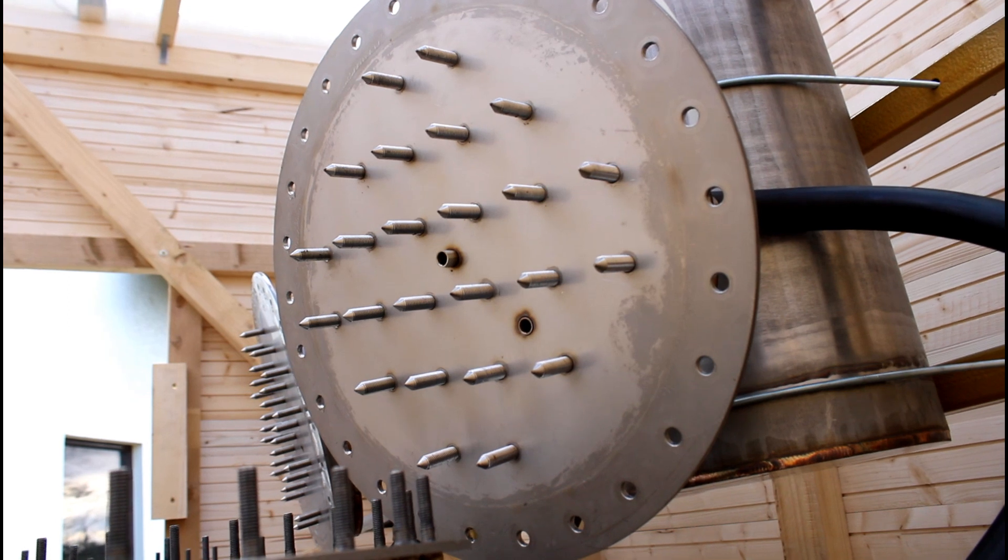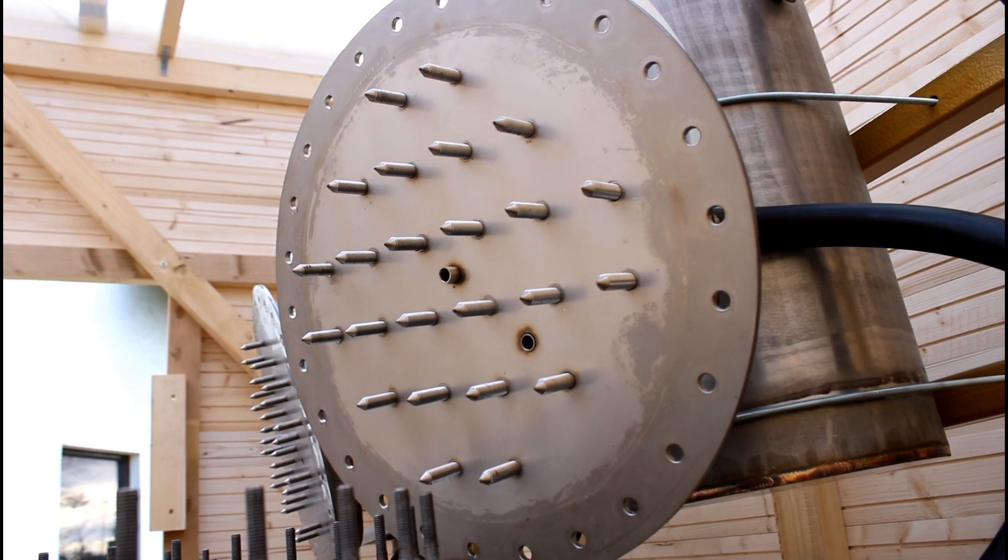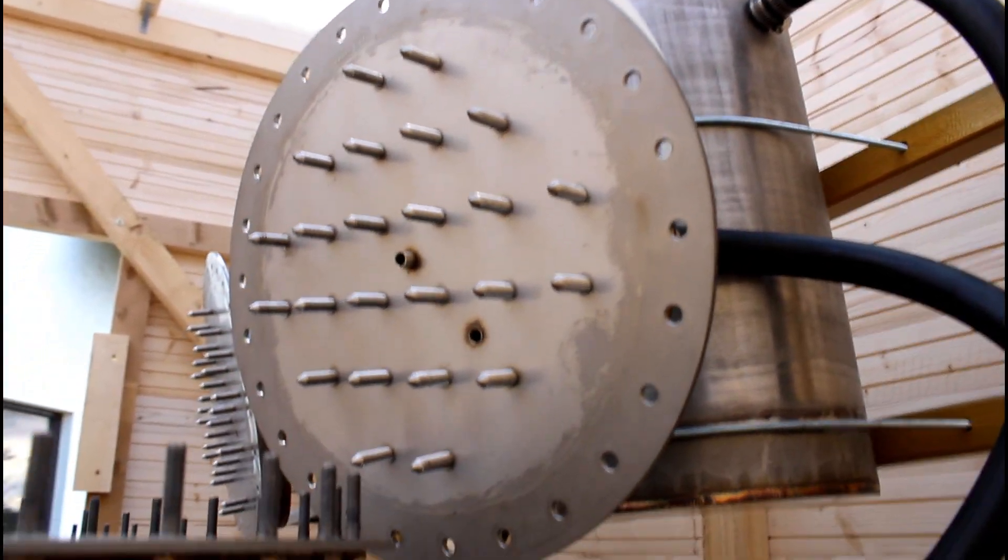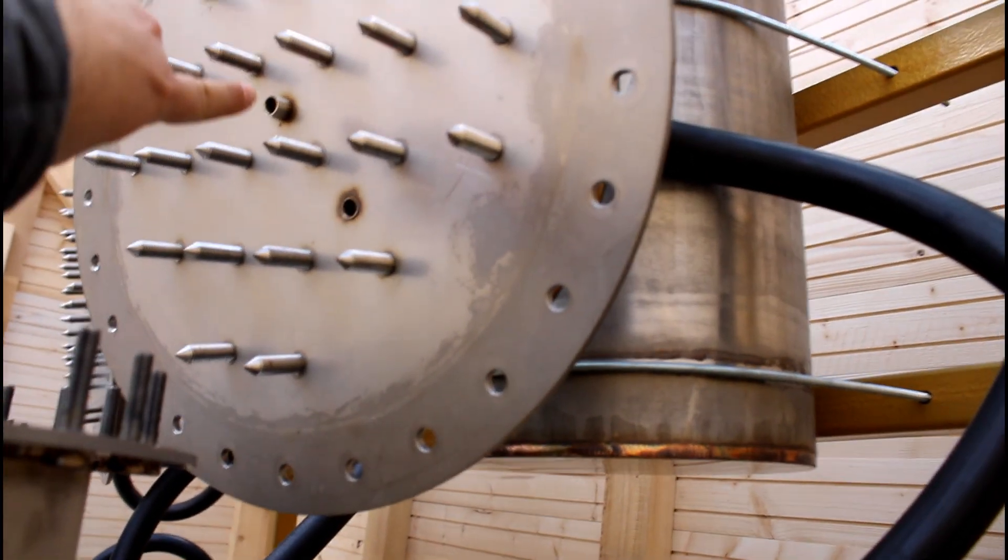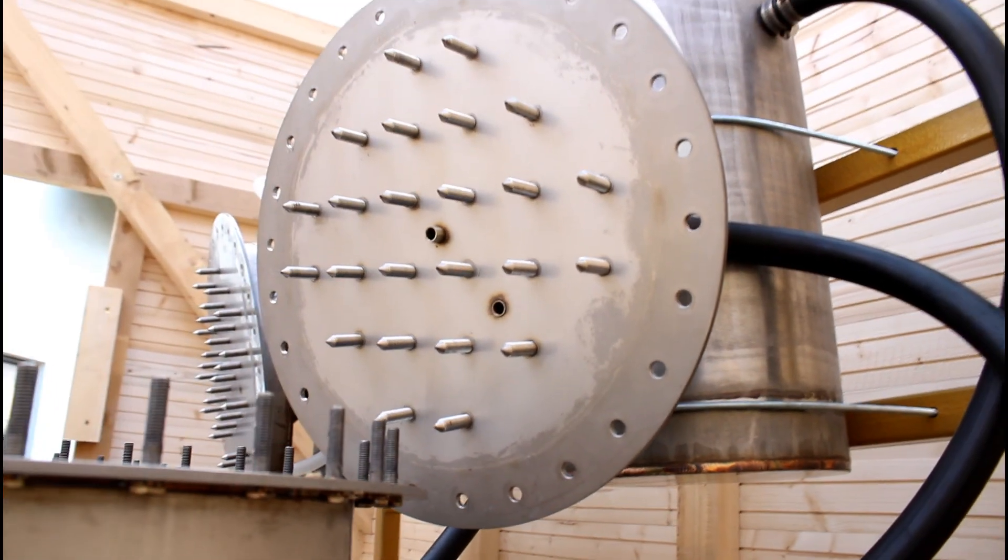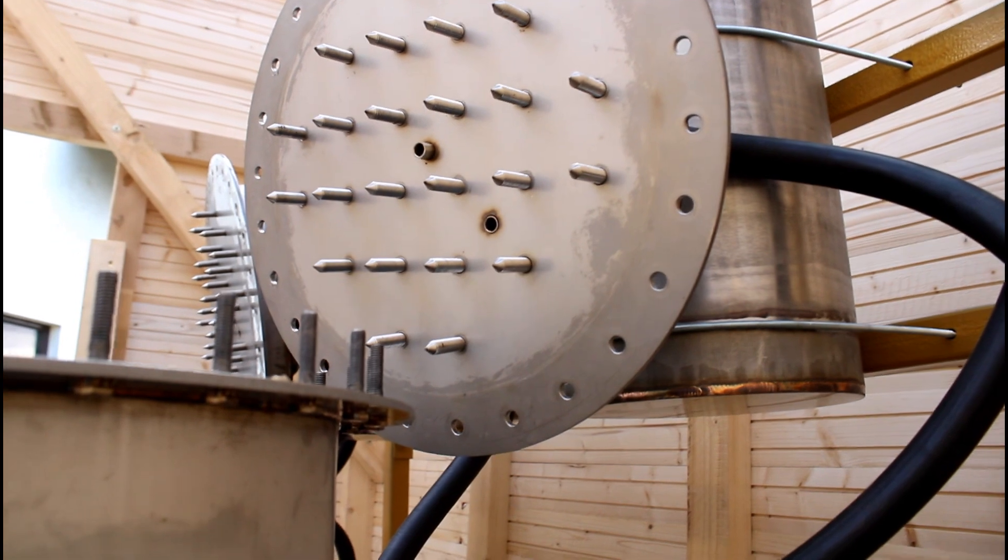If for example the condensation would just happen in the top condenser here and I have only here the backflow, the solvent would just drop on the middle of the herbal matter.